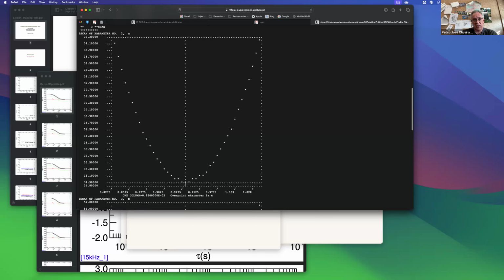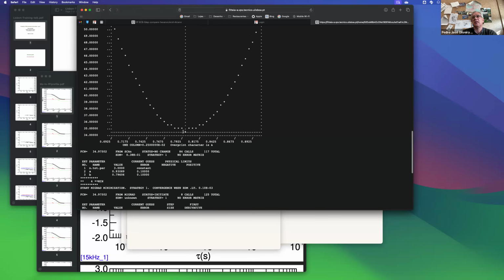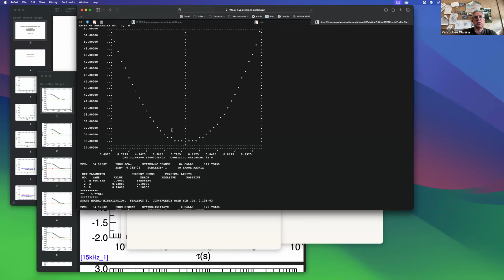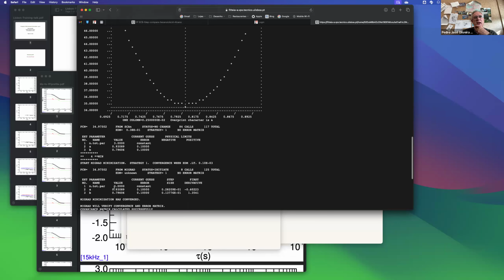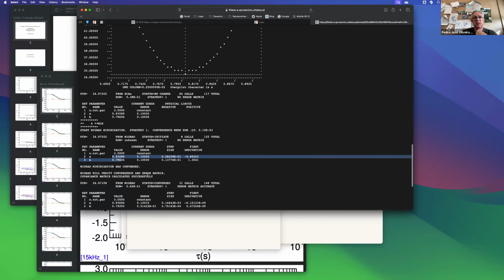So actually this is the A that makes the chi-square minimum. And for B, you have exactly the same. So indeed, this method, and obviously all the other methods that MINUIT uses, will contribute to get you the best values of A and B to minimize your chi-square.